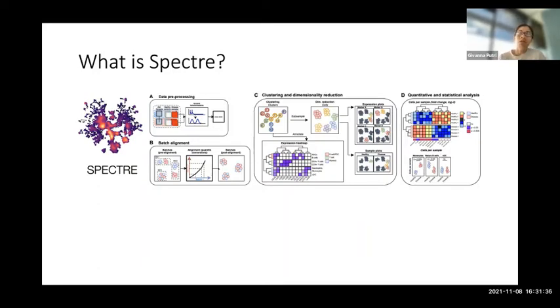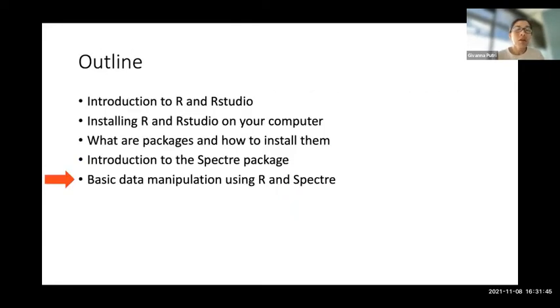All of these will be clearer to you in tomorrow's session, which will go through some clustering, dimension reduction, and some quantitative analysis for a data set.